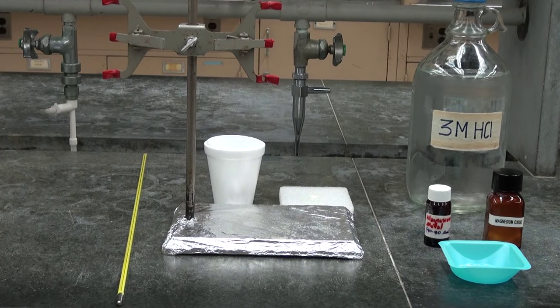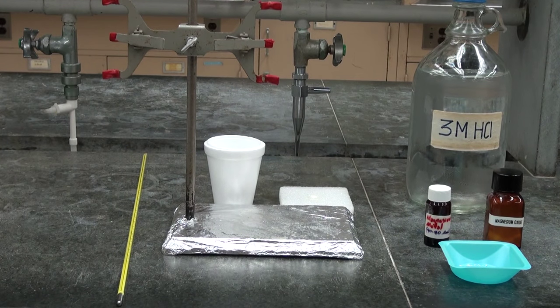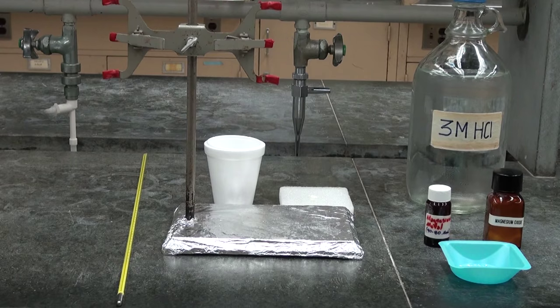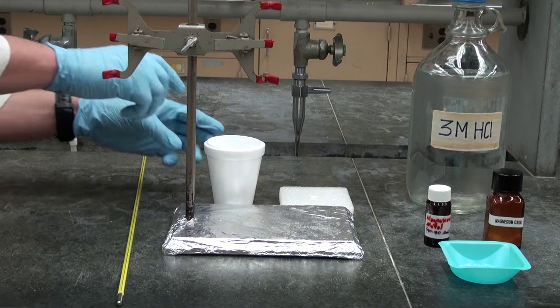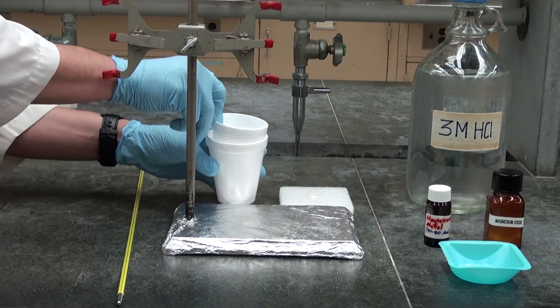A coffee cup calorimeter can be used to measure the enthalpy change accompanying a chemical reaction. It's a very simple apparatus consisting of two polystyrene coffee cups nested within one another.